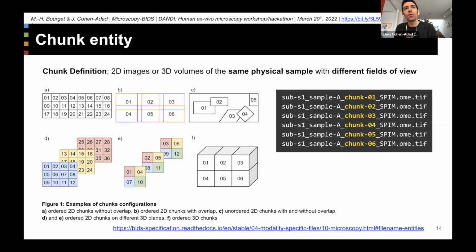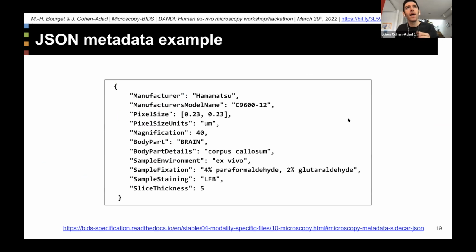Some comments and considerations also about the fact that in microscopy, it's quite common to acquire from one sample different chunks of data by moving the microscope to another spatial location. And at the end of the day, we want to be able to reconstruct them and make sure that the chunks are associated with a particular set of coordinates, right? So that's the way the chunks are physically distinguished across all the different files. And there are also coordinate systems for each of the chunks.